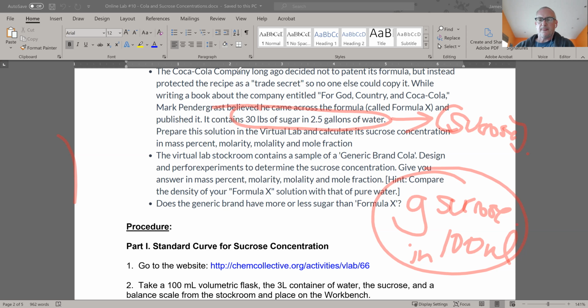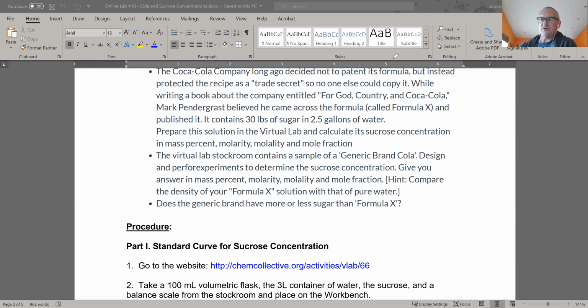You just use Excel, right? Yeah, I use Excel. But you don't have to use Excel. Basically, anything that will give you a trend line. Make sure it's linear, because you should get a linear response. You can fit lines with all different kinds of things. You want to have a linear fit, because you want to wind up with y equals mx plus b.